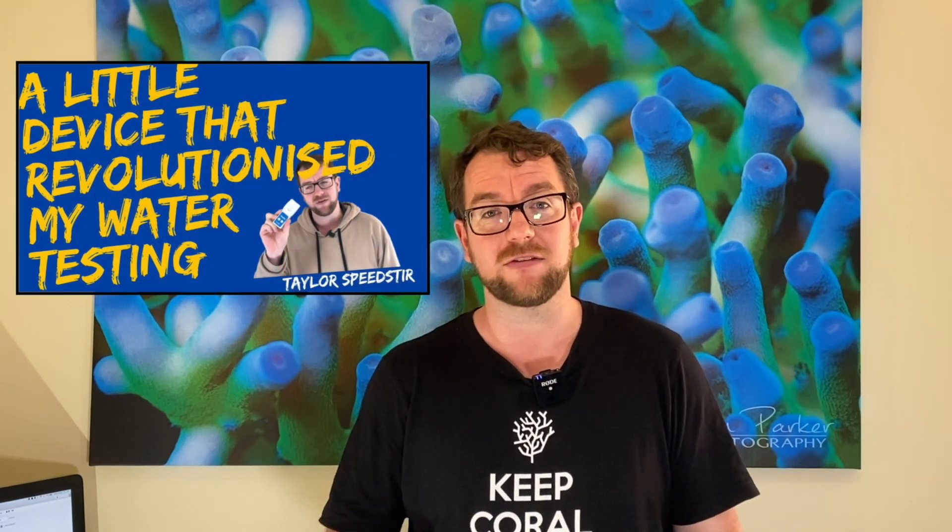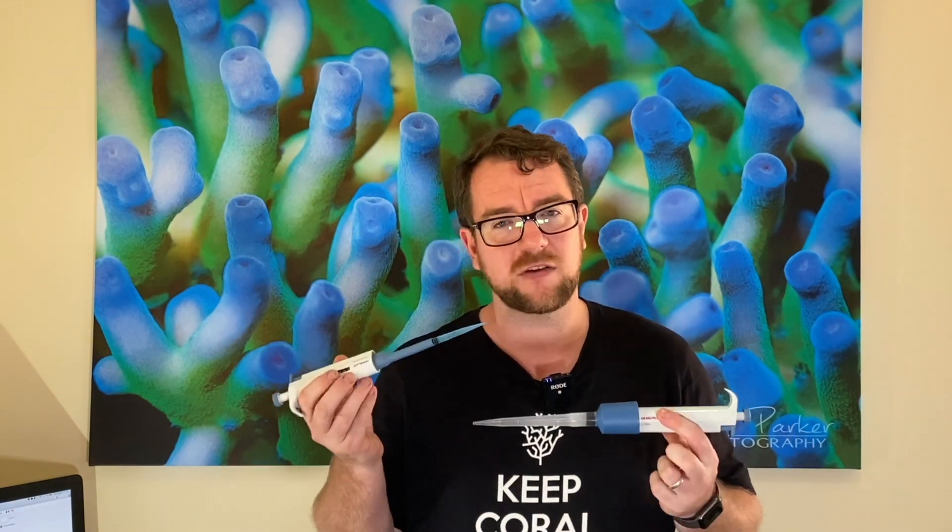The other day I put out a video going over the Taylor Speedster and it got a fairly good response. A lot of people weren't aware of it or where to buy it from, and the link helped a lot of people out. So I was pretty chuffed with that video and I figured, what other bits of equipment do I use that maybe a lot of people aren't aware of or could be useful to people? And I had a look and came across my adjustable pipettes.